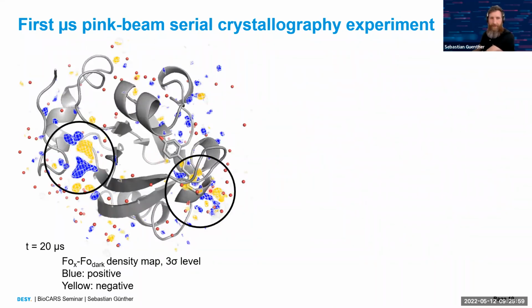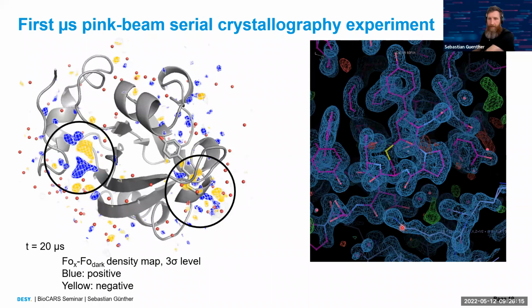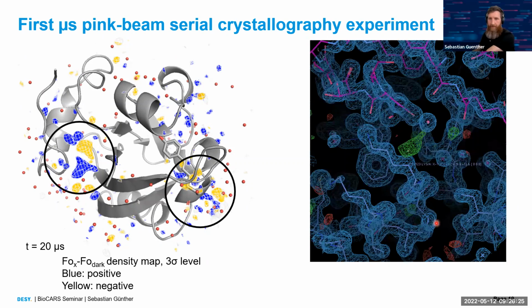This region corresponds by crystallographic symmetry to this. So here we have the chromophore, and we see some difference density signals, but also these prominent signals down here, which likely come only from a lysine side chain. This is the refined electron density for the ground state, which has an alternative conformation here, which is not present in both light-activated states. So that's the reason we have these large features here.